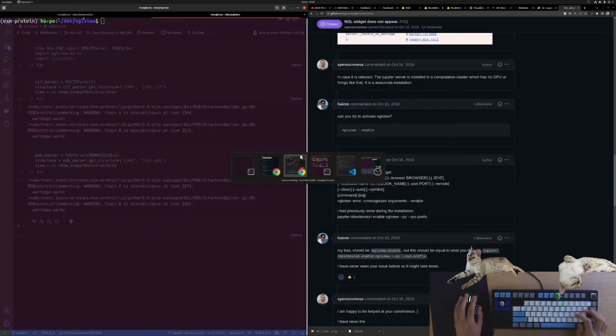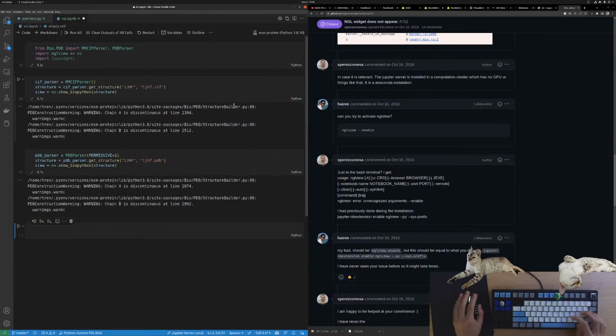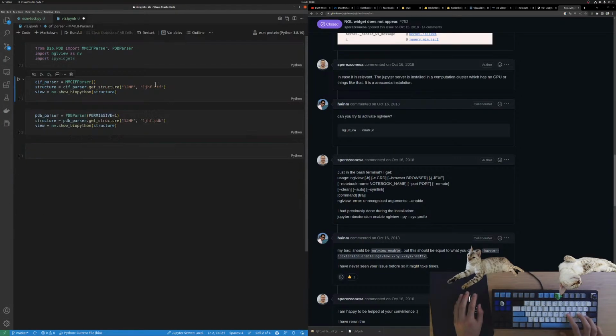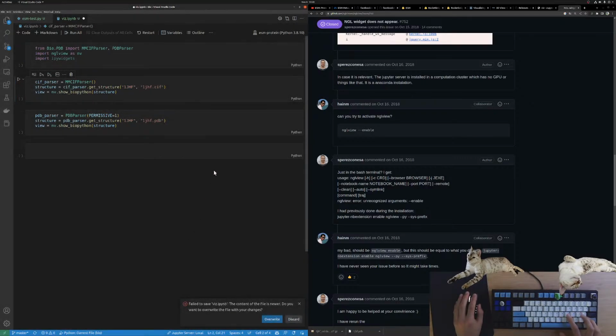I don't think this is leading anywhere, so we will maybe come back to it. I can debug this in my own time just to not waste your guys' time here. Delete. Clear output of all cells. Don't save. Cancel. Overwrite. Okay.